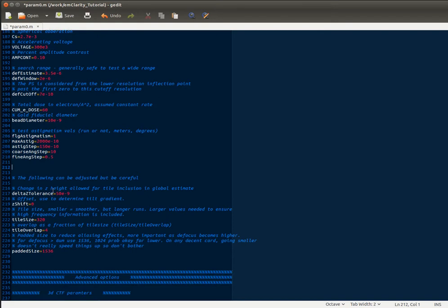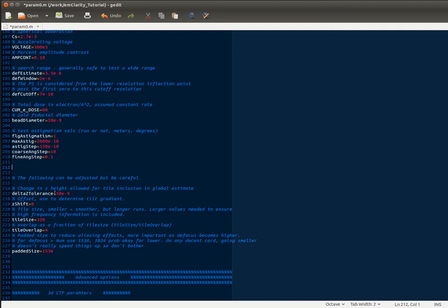And then your delta Z tolerance and Z shift. These are for basically looking at the CTF gradient to make sure that you have your handedness correct. Or that's just the Z shift, I should say. The delta Z tolerance is how much you're willing to include in the averaging of the periodograms. So 50 nanometers is pretty reasonable. Including more will give you better low resolution signal, but it'll start to blur the high resolution signal. So you can choose wisely there. A smaller number will also run faster.